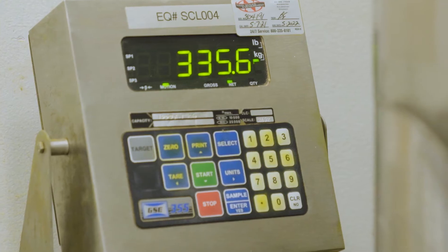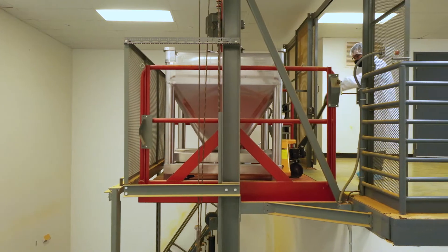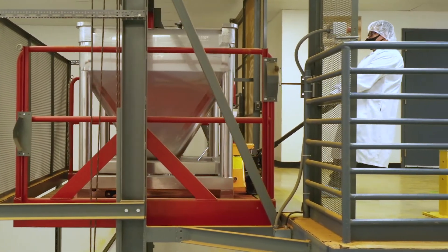With purity confirmed, the Stemregen blend is then transferred to the encapsulating room.